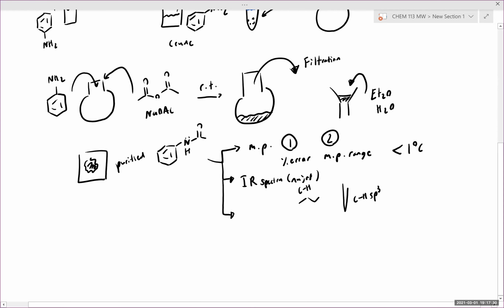The other thing that we're going to collect, and because the video is relatively short, I've included not only the proton NMR, but the carbon NMR. I found proton and carbon NMR on a 400 megahertz instrument. So for this lab in particular, you'll be able to explicitly assign your multiplets, singlets, doublets, and triplets. You'll be able to more effectively note the splitting pattern, and I've included the integrations.